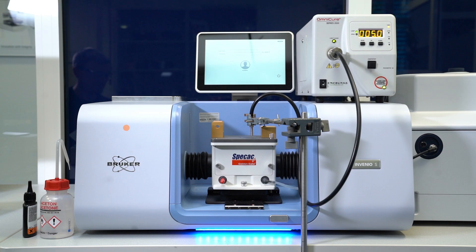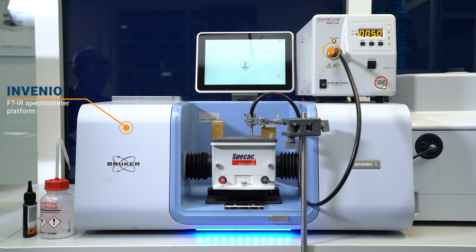This is our setup: the Invenio FTIR spectrometer, a UV lamp to start the reaction, and of course the glue itself.